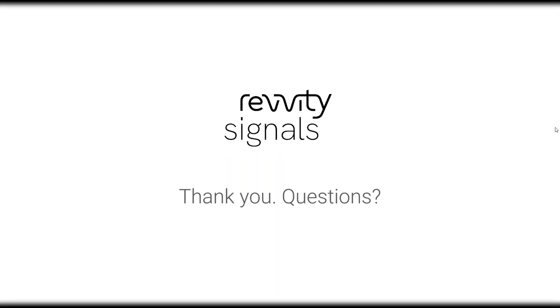And to a Signals inventory question, is Signals able to automatically update the amount of a sample based on the consumption recorded in experiments across the organization? So for example, if you have an item that's been checked out and is being used in an experiment. Yeah, not automatically. No, not yet. That will be something obviously for the future that we'll be trying to incorporate, because that certainly makes things easier for the scientists. But yeah, not as of yet.